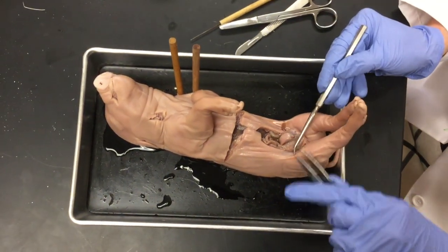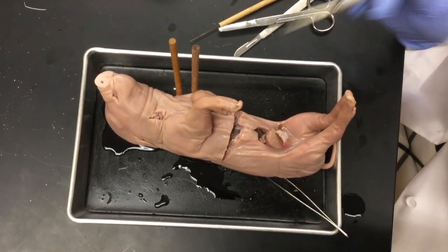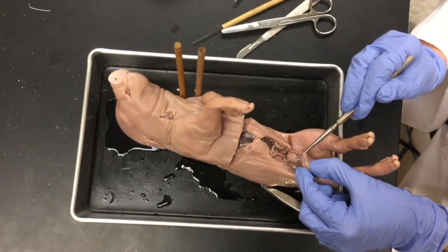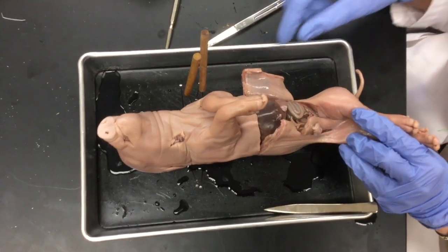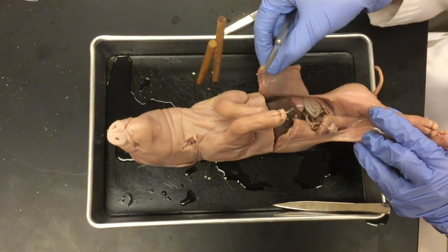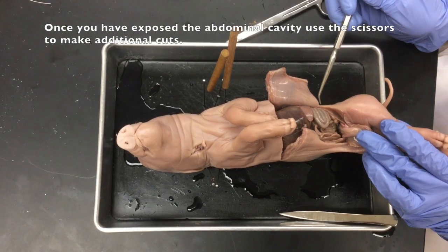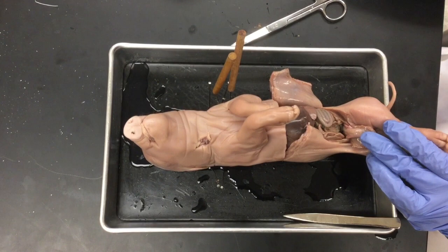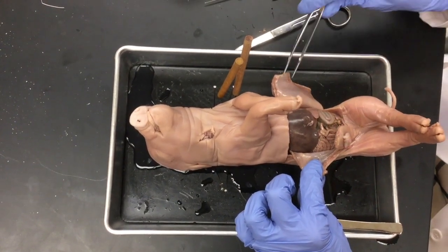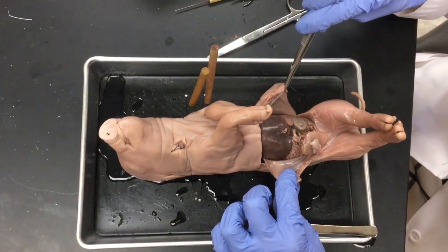On either side of the structure we just cut, you can see there is an artery — and there's one on this side as well, though it's a bit covered up. At this point the abdominal cavity is mostly open, and you can see the cut almost opens it like a book. I prefer to use scissors here because we can see exactly how deep we're going and can see that thin peritoneum film. You can see the layers of muscle — many of your pigs may not be quite this developed, so you won't see that amount of muscle.